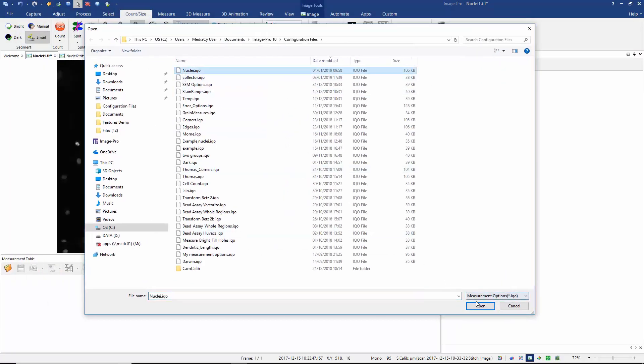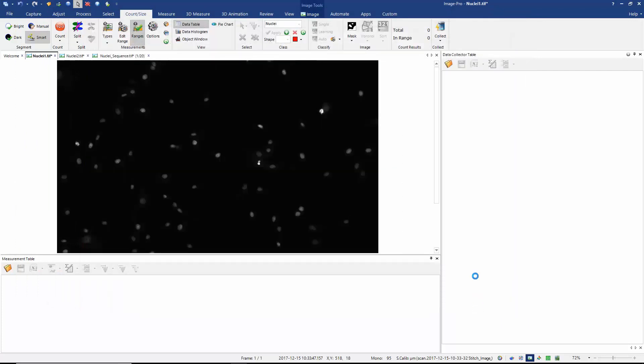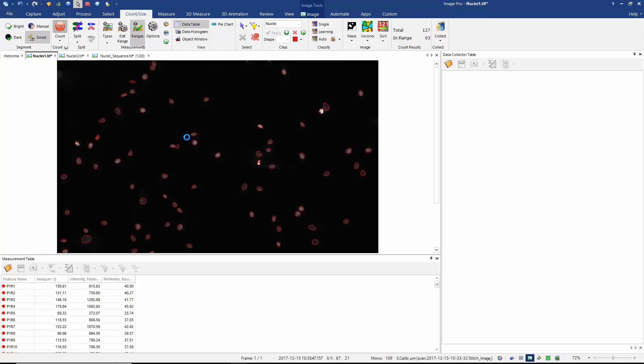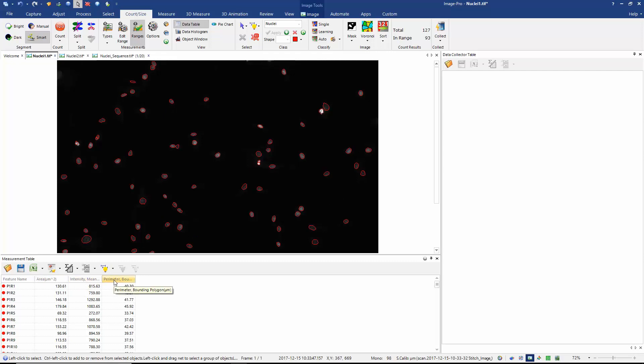I'm going to restore my measurements options. My measurements options restores my measurements types, my ranges, and my protocol. Here I'm using a smart segmentation protocol. So I can now click on the count button and you can see that I find all of the nuclei in my image and I'm measuring their area, intensity, and their bounding perimeter.